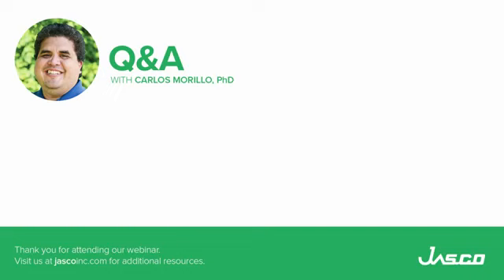I hope to demonstrate in the near future that for very rough samples we can have very nice mapping and measurement of the surface. But for FTIR, due to the resolution and the scattering of the sample, it is quite challenging.